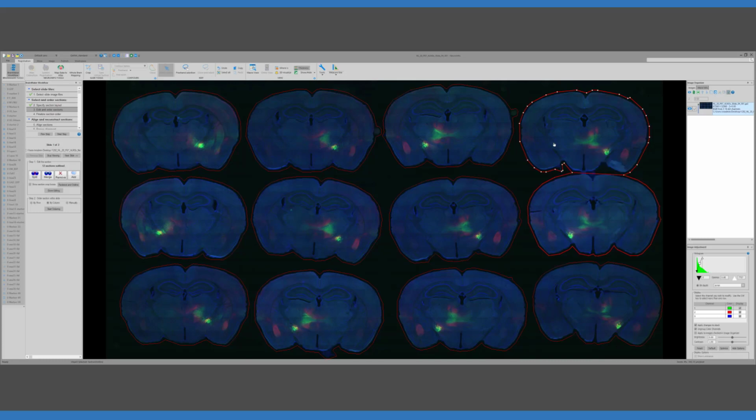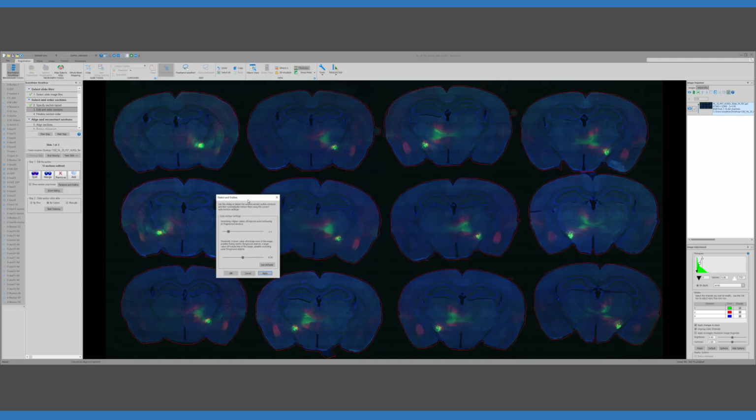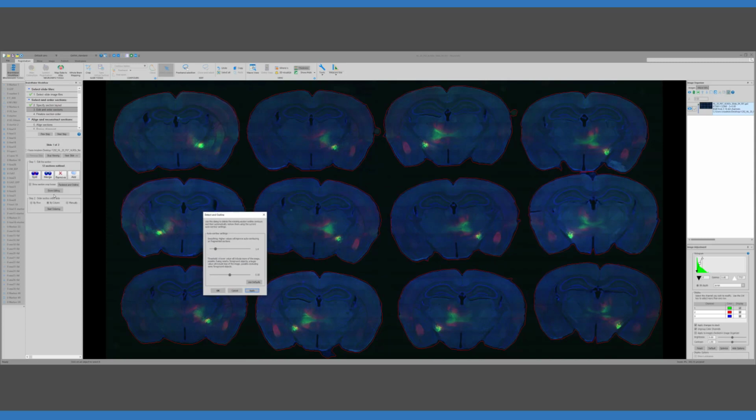Okay. So then after these have been split, let me go back and redetect. You might want to change that smoothing back to around 2.5, somewhere in there. So now we go through this process and it's detected and outlined the sections.